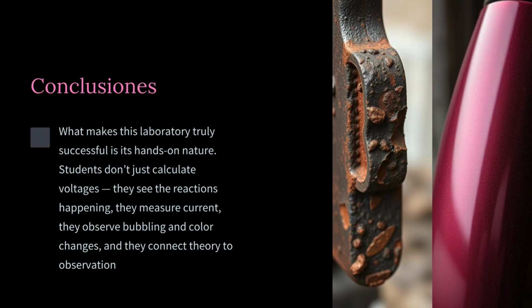They also explore multiple strategies for corrosion prevention, from passive methods like sacrificial anodes to active control through impressed current cathodic protection. The results show that students learn more, enjoy the lab more, and remember the concepts better, especially when the labs follow a foundational activity focused on batteries.